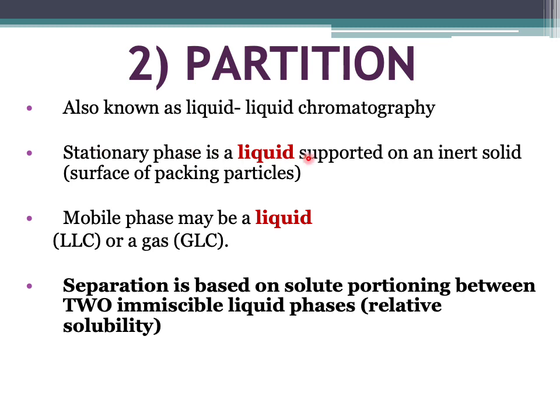So stationary phase is a liquid supported on an inert solid or surface of packing particles. So we have the solid. Okay, and this solid is surface packing particles. Ada particle kat solid tu. And then there is a liquid. Yang liquid yang pegang pada solid tu. Solid yang pegang liquid. So that's why the stationary phase is a liquid supported on an inert solid. And mobile phase mesti liquid, ataupun it can be gas. So that's why partition chromatography is liquid-liquid chromatography or gas-liquid chromatography.